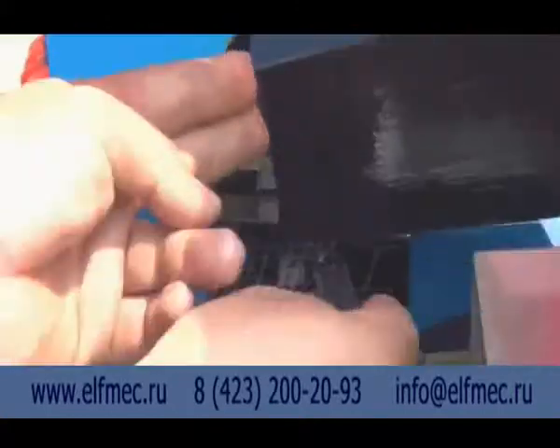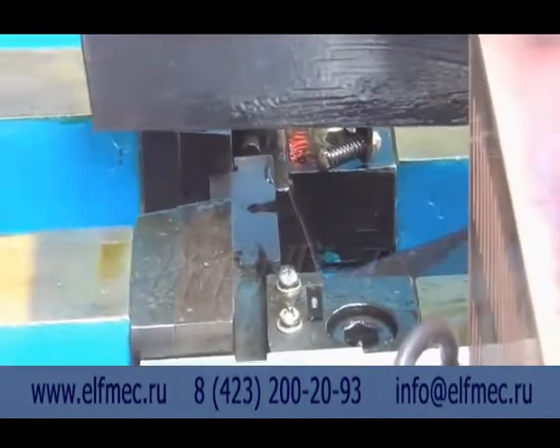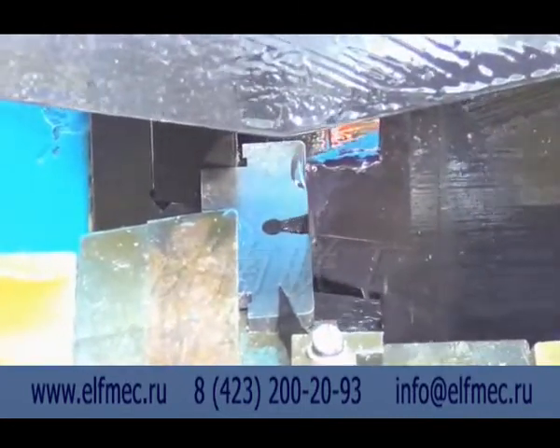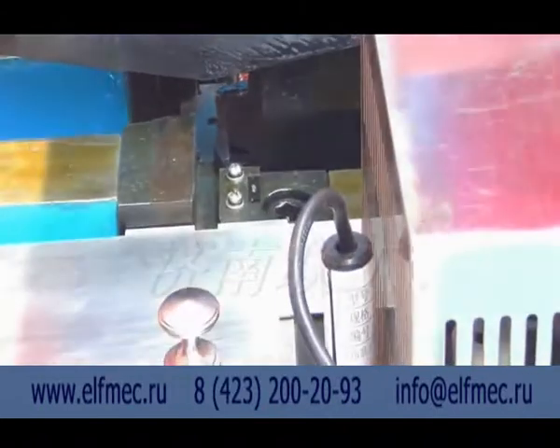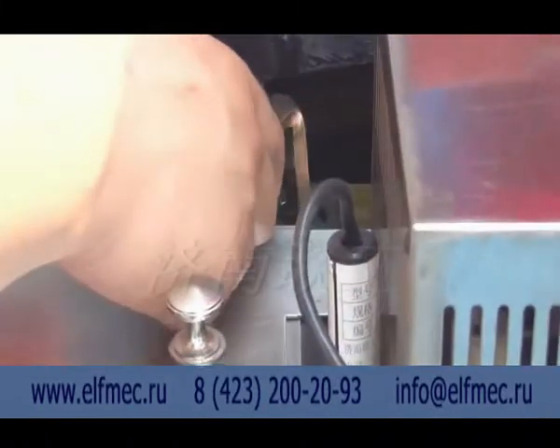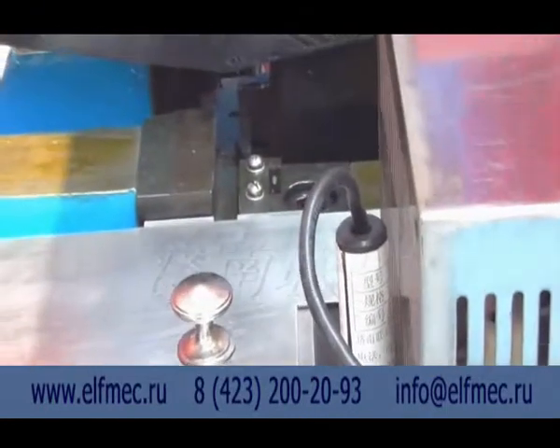Big pendulum span adjustment. Place the span alignment plate on the impact jaw spot. The gap direction overlaps with the pendulum blade. Then push the pendulum slightly to the gap of the span alignment plate. Check whether the gap and the blade are coincident, and whether there is a gap in the 40 mm direction of the two jaw spots and the span alignment plate. If there is a gap after the press block of the front and the back clamp is loose, adjust it to a standard range.